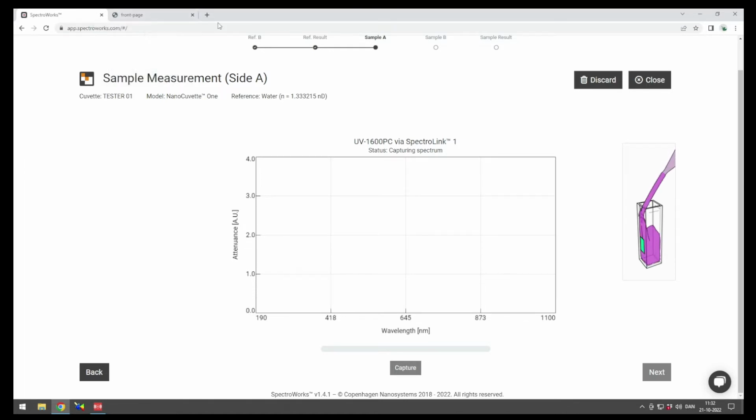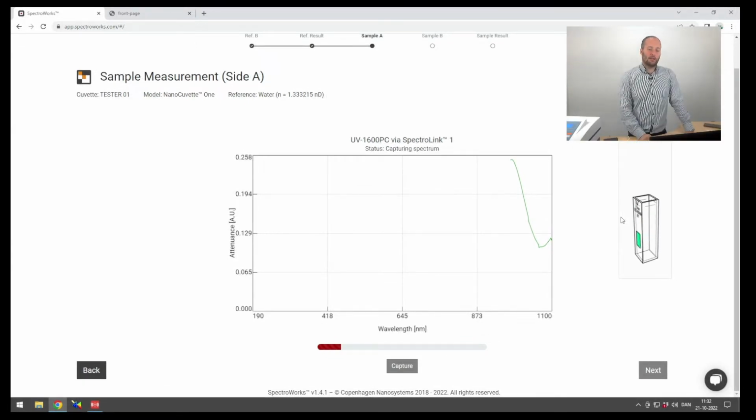One thing that is important to note is that the box code is also engraved on the cuvette itself. Below the number, you will see a series of letters, and this is the box code. We decided to engrave that on the cuvette itself in order to capture if people ended up misplacing a cuvette into a box that it didn't belong to. Then you can always cross-reference the ID and make sure that you use the right ID.